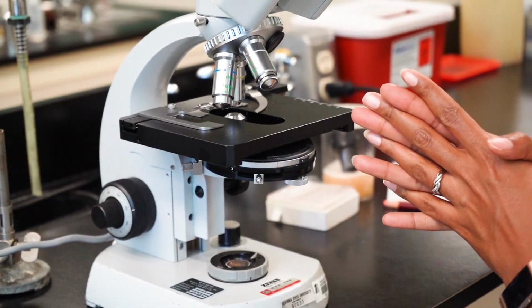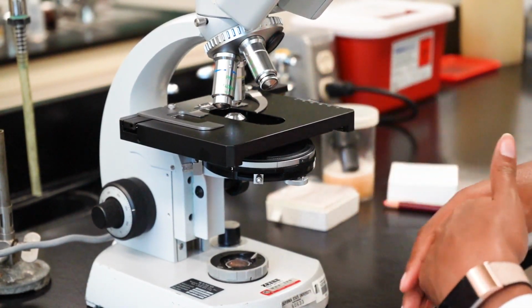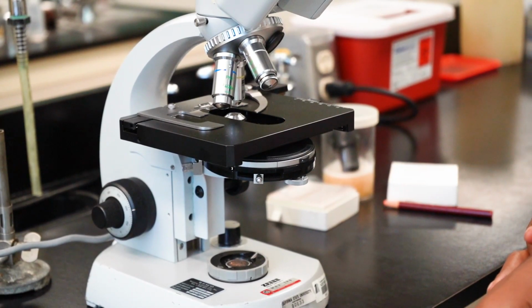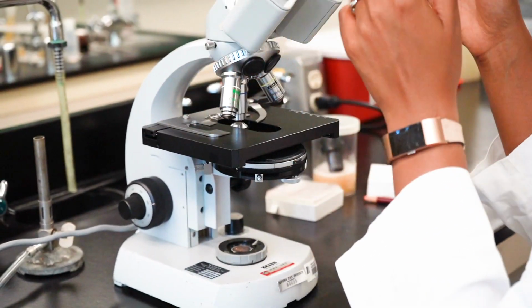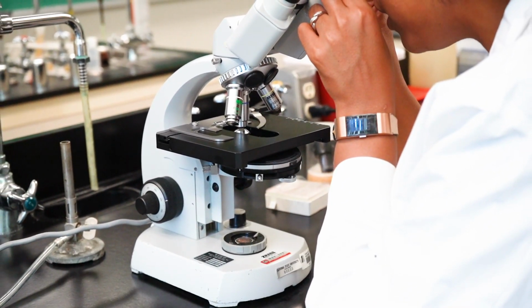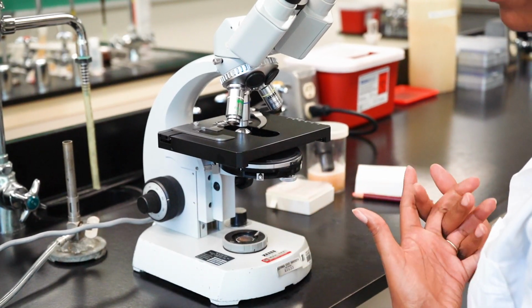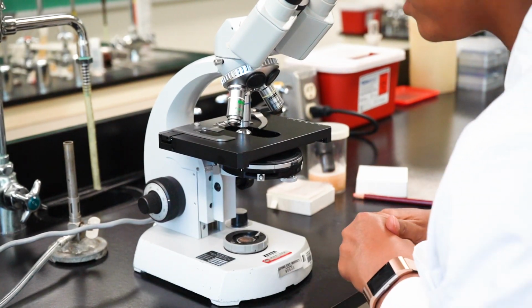In a microbiology laboratory, however, we don't usually use the microscope at low power because we're looking at very small beings. And so to view them, we're going to have to increase in magnification. However, when you increase in magnification, if you look through the telescope, you'll notice that the apparent size of the iris diaphragm decreases. Okay? And that means that there needs to be an adjustment made at every increase in magnification so that our field of view is filled with 4/5 of light.